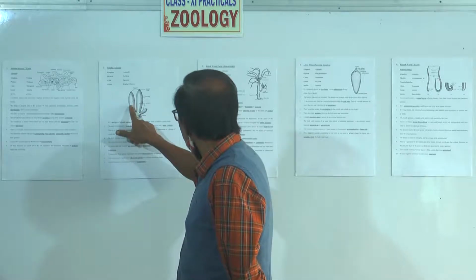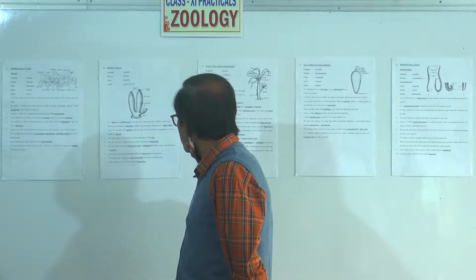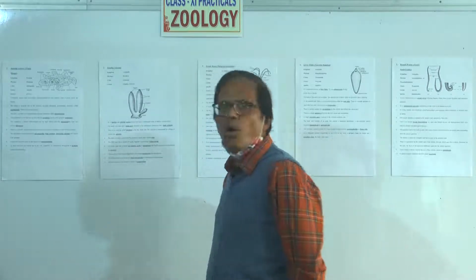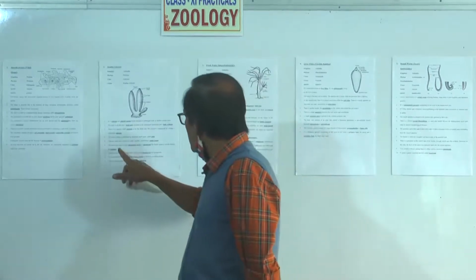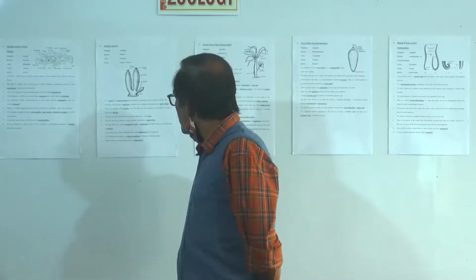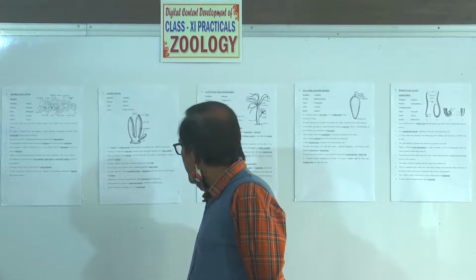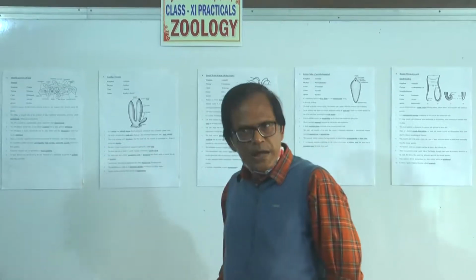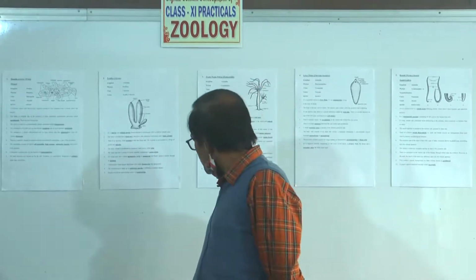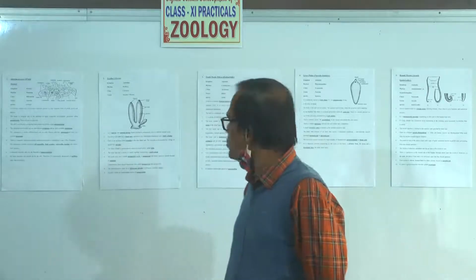The body cylinder is perforated by many minute pores called ostia. The ostia open into a system of canals, together constituting a canal system. All canals open into a central paragastric cavity or spongocoel that finally opens to the outside through an osculum.